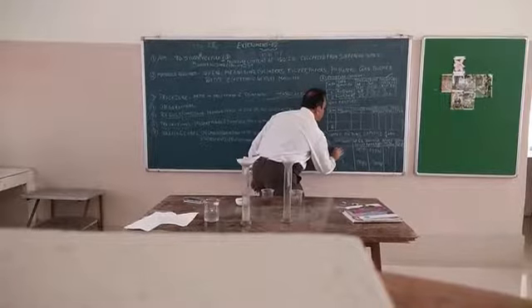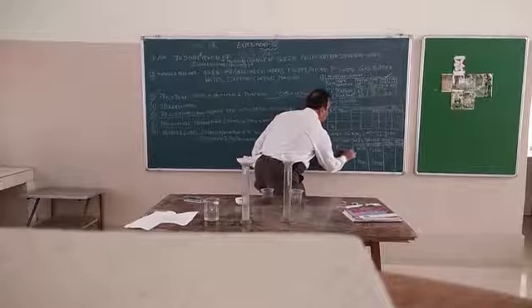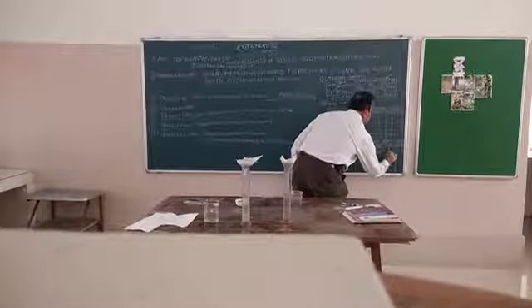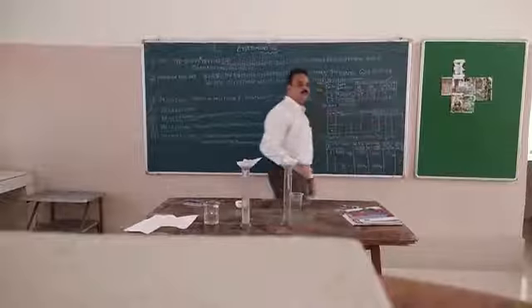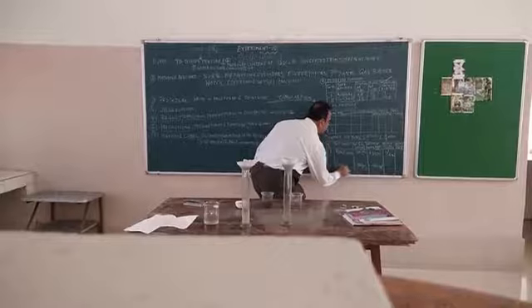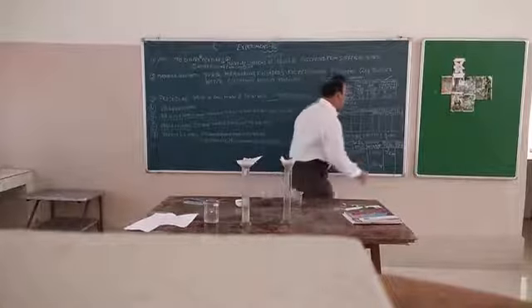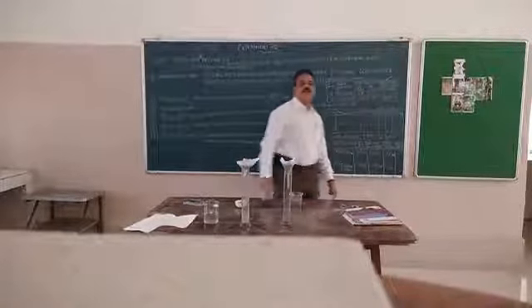Volume of the water collected, which I have just shown. Taking this as the roadside soil, A, when I put this 100 ml, you are able to see that out of 100 ml, something like 72 ml has come off. And here, garden soil: out of 100 ml that I have poured, you are seeing around 42 ml only has been filtered.